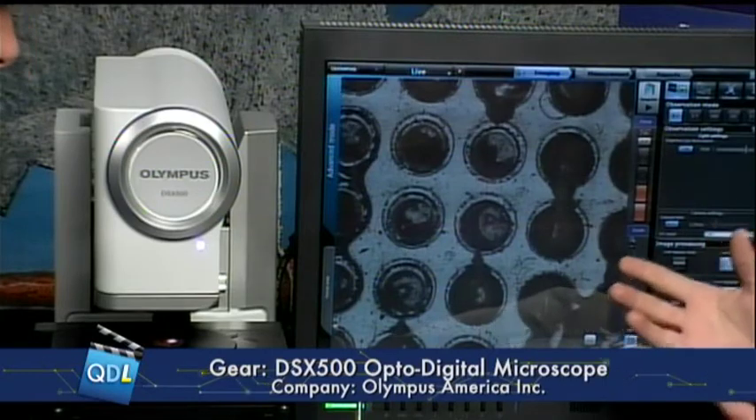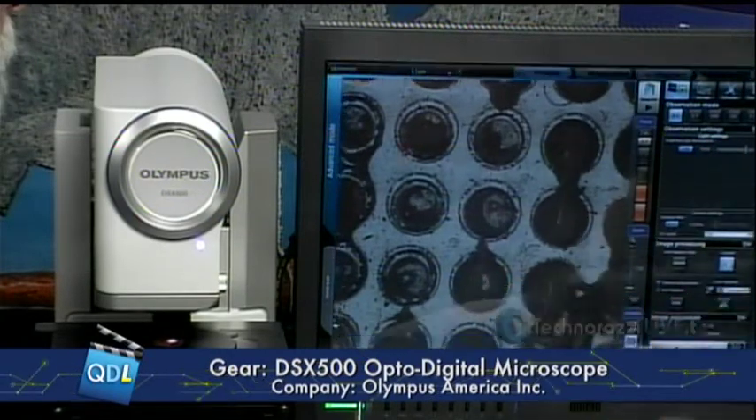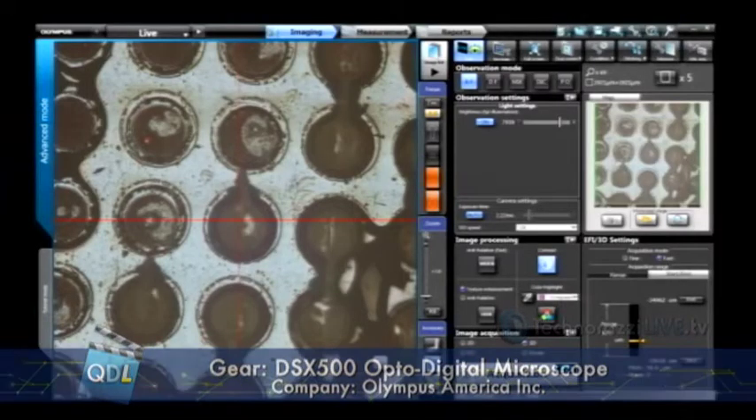The system runs with an intuitive touchscreen operation, which improves ergonomics — you're not hunched over eyepieces like with a normal microscope. We have a very high frame rate camera system, and all of our normal observation methods are accessible with a one-button push: bright field, dark field, DIC, and polarization — most of the imaging techniques you'd see on a normal microscope.